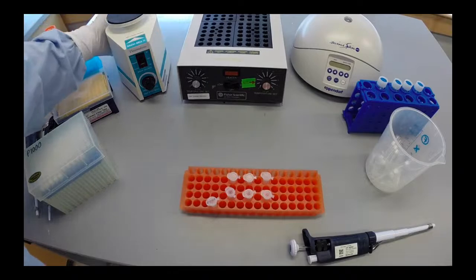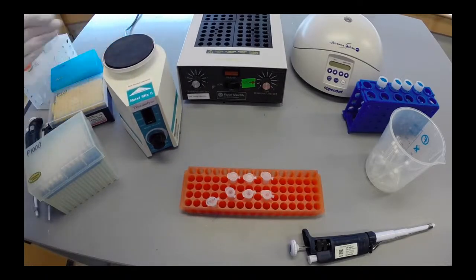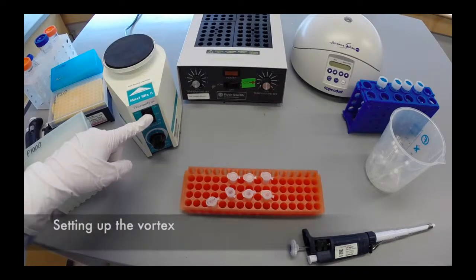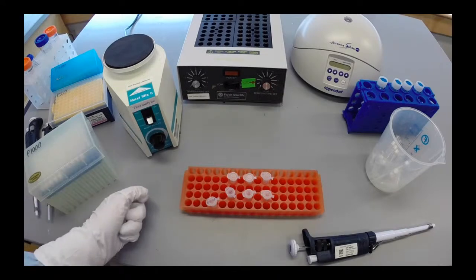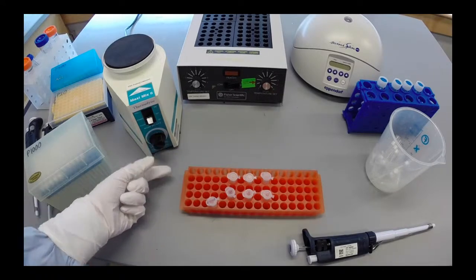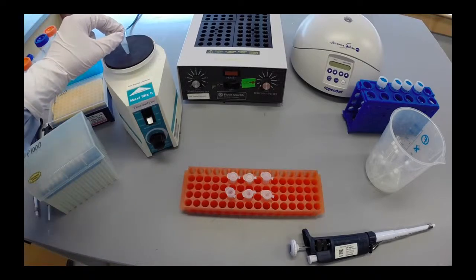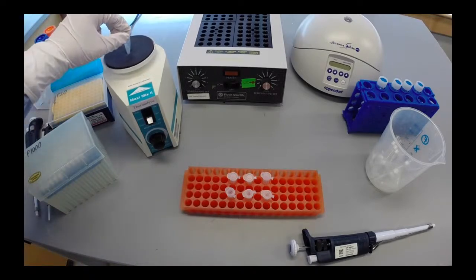Mix the solution with a vortex. To turn on the vortex, press the switch down to touch and turn the knob clockwise to ensure maximum speed. Hold one tube at a time and press the top of the black pad to initiate vibration.